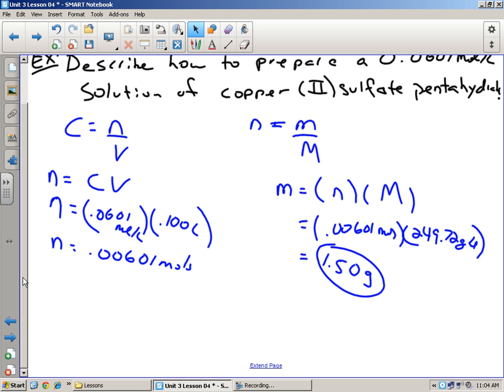And usually what happens is you fold it up like so to make it more into a boat. And then you kind of pour it into there. If you think you can do that accurately, good for you. You might be able to. Would I use this with perhaps this one? Probably, because look at that opening. It's fairly big, right? I could probably do that, hopefully. Having said that, there's still something else you need to do with that.